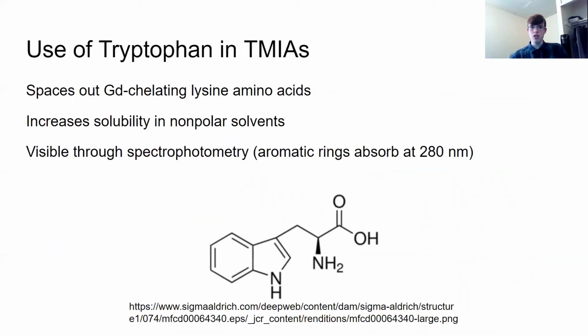This project will also investigate the use of tryptophan in TMIAs. We believe that because this spaces out the gadolinium containing lysine amino acids, increases the solubility in a variety of solvents, and is visible through spectrophotometry, that this will create more effective targeting agents.